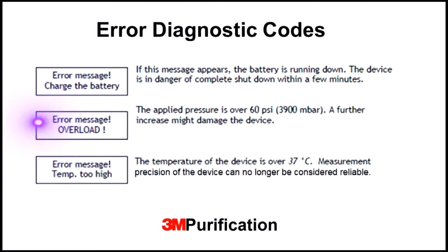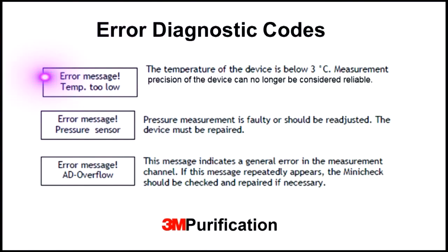One message is an indication that the maximum recommended pressure has been exceeded. Pressure should be immediately reduced or the device disconnected from the pressurized system. Another message is an indication that the maximum recommended device operating temperature has been exceeded. Note the resulting measurements are potentially no longer reliable. Another message is an indication that the pressure measurement yielded by the device is no longer reliable. An additional message is an indication that a measurement error is present. For either of these error messages, contact 3M Purification Technical Support.